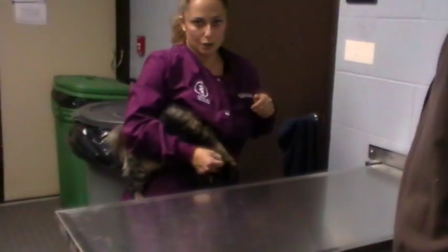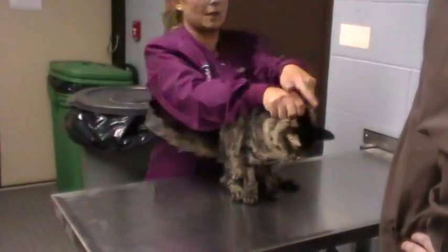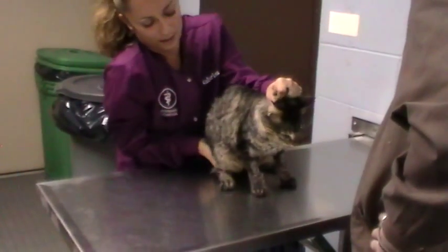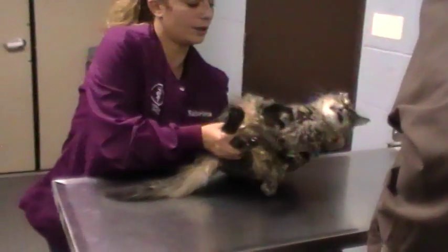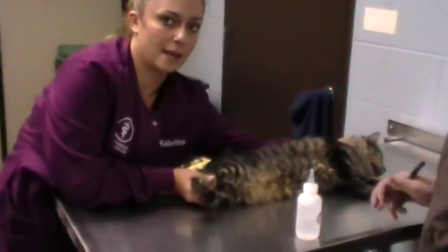Now we're going to show you the medial hold. This time I'll switch her to left lateral — left hand, scoop underneath, finger between the legs, up, turn, supporting her spine. And there's my lateral.